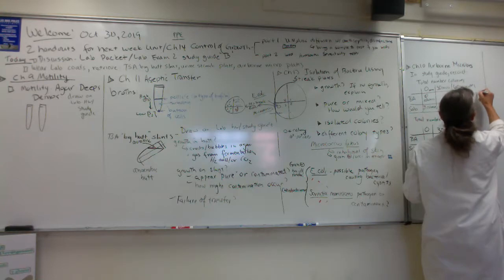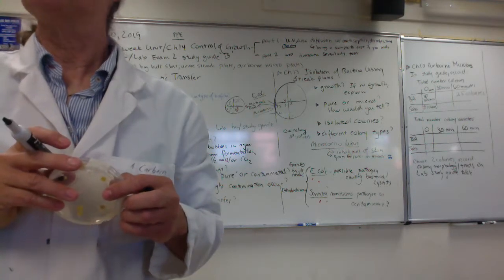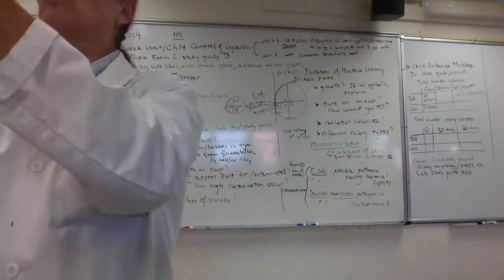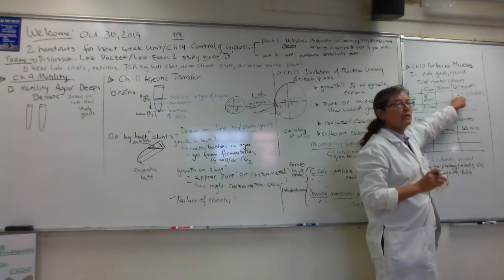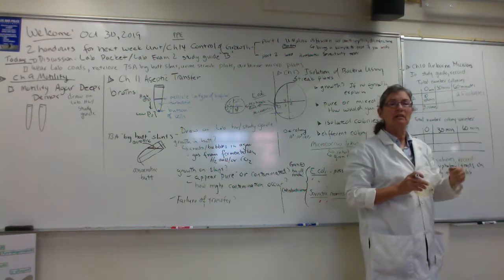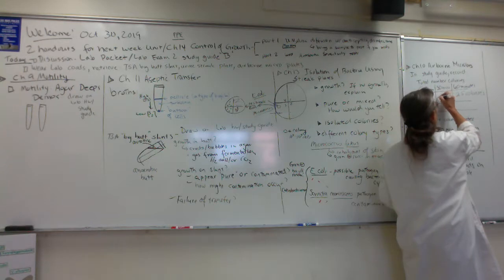Yours is going to be different, and you know why? Different places in the lab have different loads of microbes in the air, right? So yours might be really different. But we're first counting the total number of colonies. If at 60 minutes I have 25 colonies, what would be your guess for the number I should have in half the time? Half of that. It doesn't always work, but I'm going to make this data up. I would guess I probably have around 12 colonies at 30 minutes.